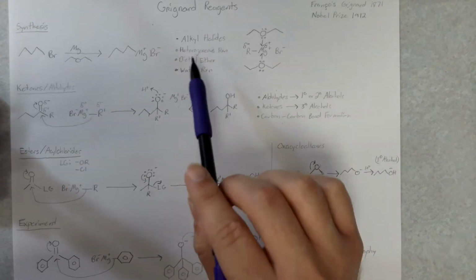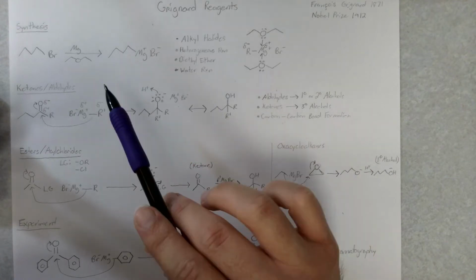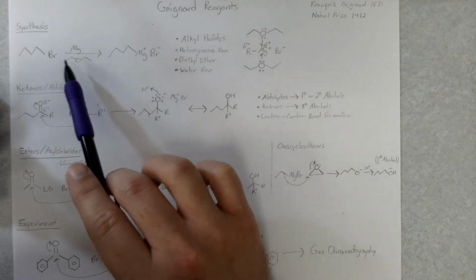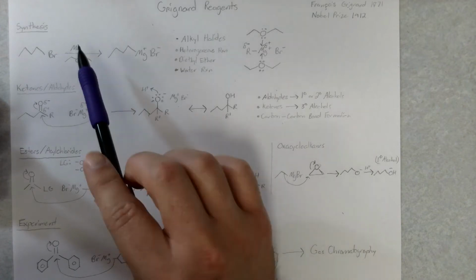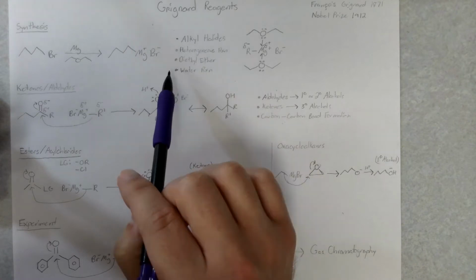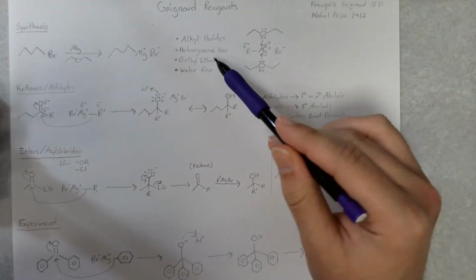And this is what's considered a heterogeneous reaction. That means it's using more than one state. So while all this is in solution, the actual reaction is happening on the magnesium, the solid surface. That's why it's considered a heterogeneous reaction. This is all also occurring in diethyl ether, and that's very important.